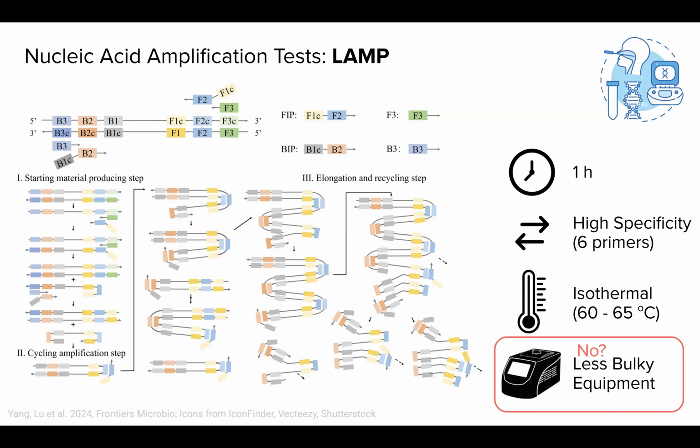Going back to the LAMP. I've never really done a LAMP, but I'm familiar with library preparation and PCRs and all that. So, quick question on the LAMP for the isothermal portion of the reaction. How do you know what temperature, depending on what type of product you're looking to get? Is it a trial and error type thing, like you do with PCRs, or is it something a little bit more standardized? Yeah, that's a great question.